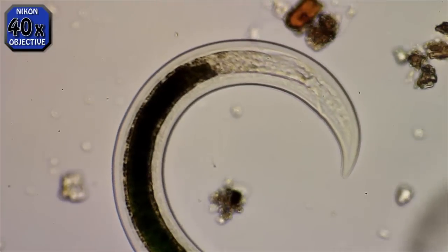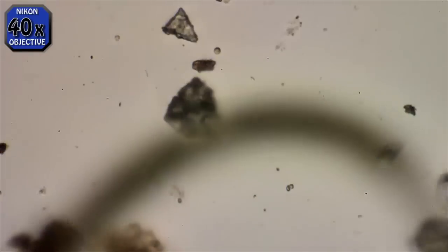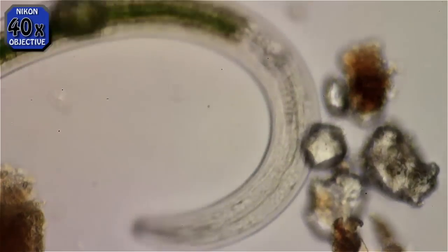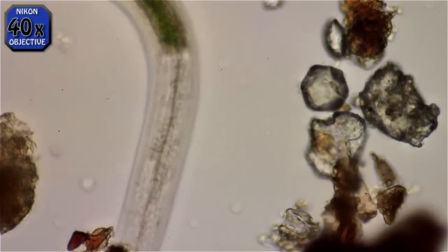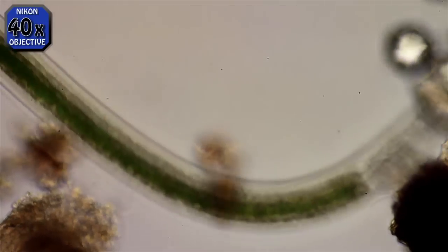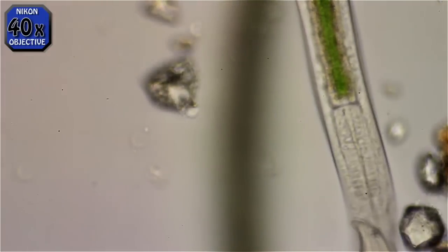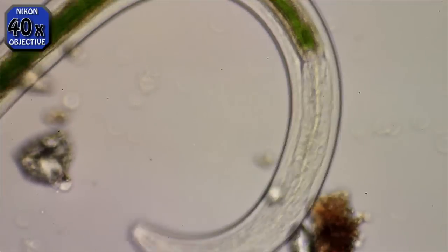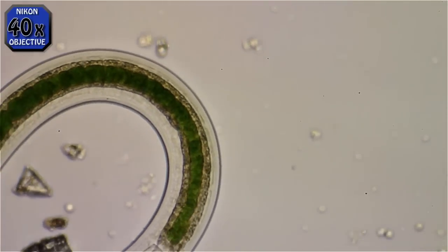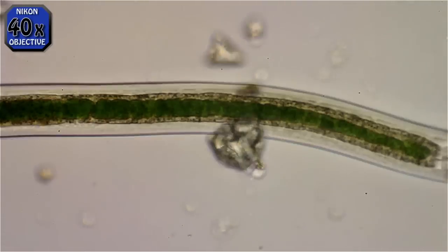Here at the very tip, on the inside of the hook, you can see a small line — that's the anal tract going out to the surface. This is the head end; you can see the mouth. It doesn't have teeth — it's more like a sucker, like a snail you might have seen on aquarium glass. That's the adult. The larval stage does have teeth and can get in through the skin, and it's so small that you don't feel it and don't know it's happening. You can also get them through ingestion by not washing your garden vegetables well enough.